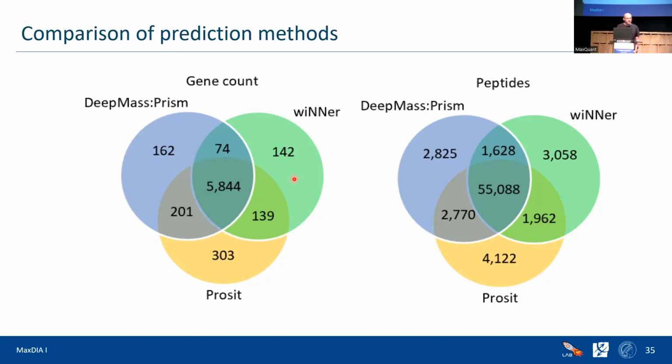And this is actually very good news because that means that we can just pick the simplest. So we can just pick the non-deep learning model, which apparently, at least in this in silico prediction context, doesn't really have a major or any disadvantage. But it actually has many advantages because it's very fast. It's much faster than deep learning.